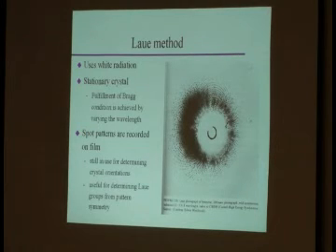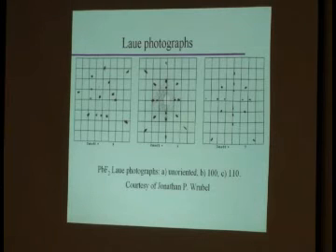What does stuff look like in real life? Well, here's a real life example. Scavenged from a friend. This is PbF2, so a much simpler system. The last one was actually a biological molecule. And this is what you will typically see when you take a shot at your crystal.